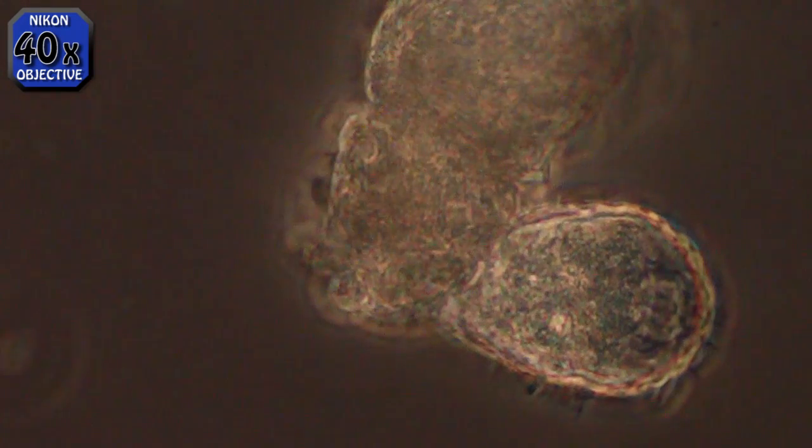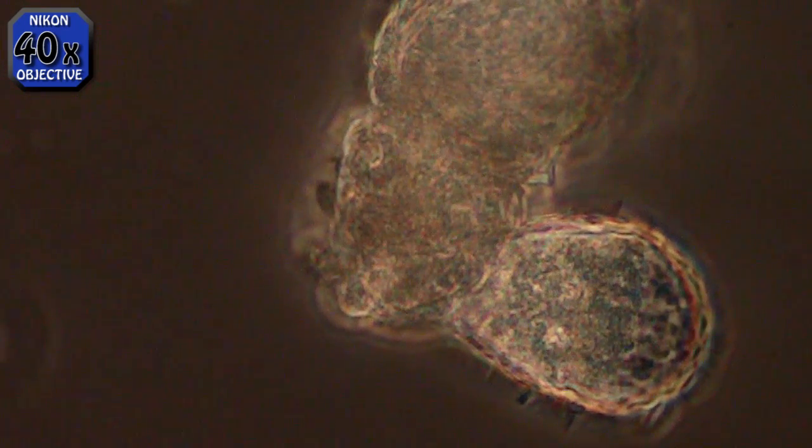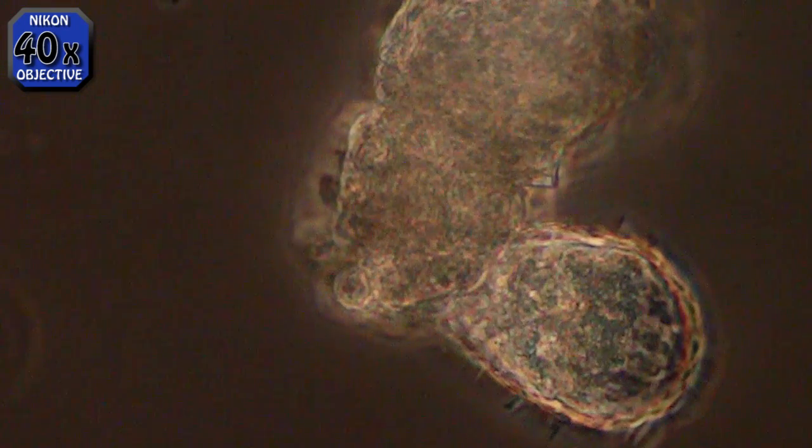If you look to the right, just forward of the vacuole-looking thing, you'll see some small particles. I believe this is where the food goes when he sucks it in.